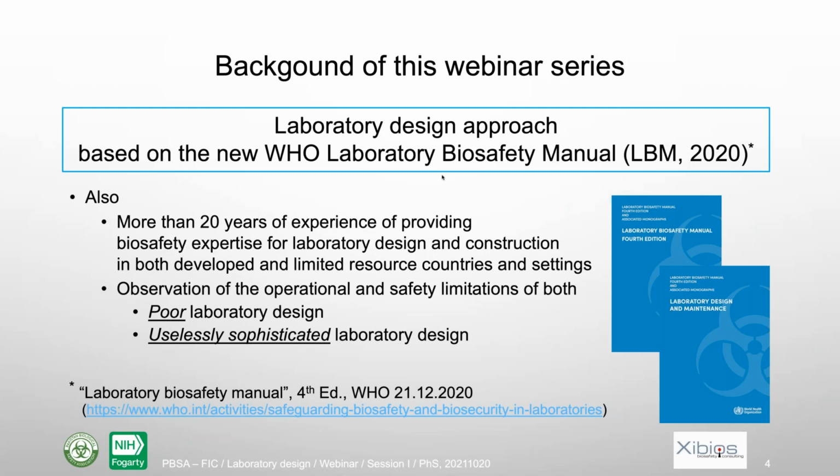And from that experience, I can tell you one important thing is that there are many limitations in the operation of a lab or in the biosafety of a lab that can be due to two main aspects. First, a poor laboratory design, so designs which are not well designed, and also problems with labs that have too sophisticated technical solutions. And in that case, it poses problems both in low resource countries, but also in rich countries, I would say.